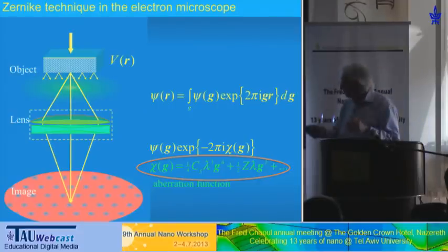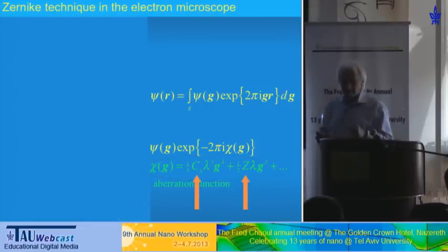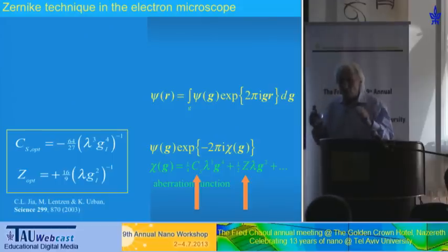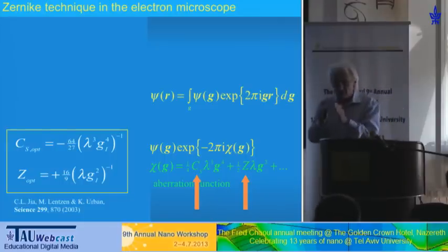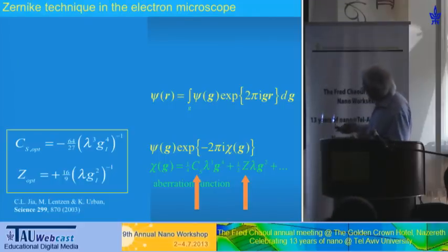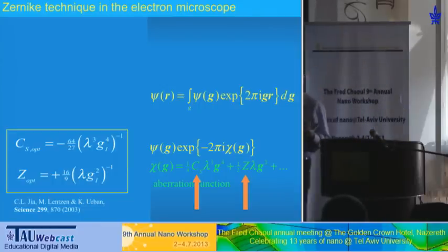And this means that we do not really focus our object entirely. We do not work at ideal focus. We do on purpose defocus our object a slight little bit. By a given amount, we have to defocus. Otherwise, we have no access to the phase of the signal. And we also found out, I just discovered it's already 10 years ago, that it's also useful in an aberration correcting microscope not to correct the aberrations entirely.